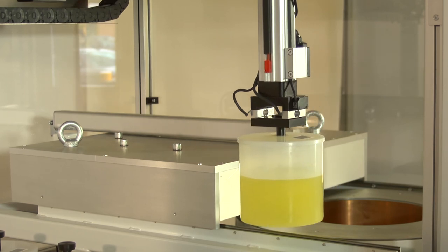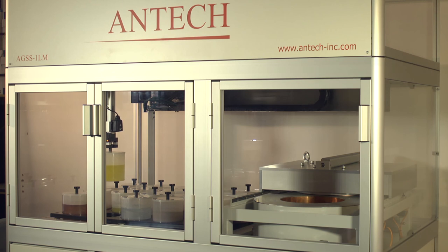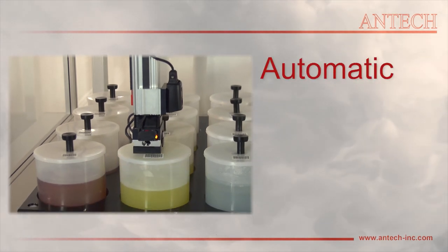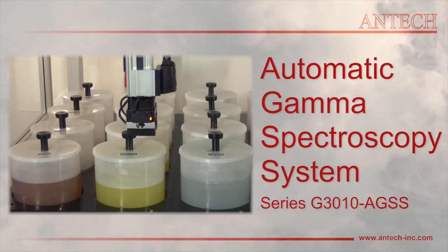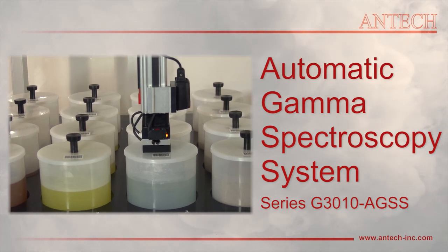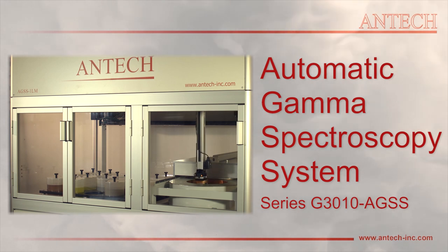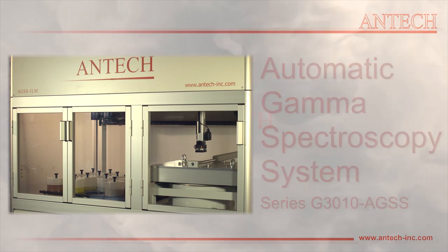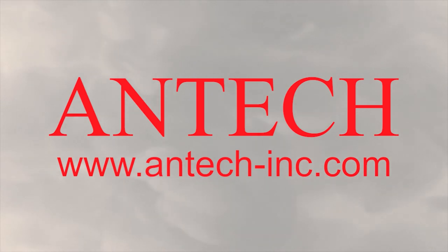The AGSS is designed to operate unattended, thus maximizing measurement productivity and cost effectiveness.